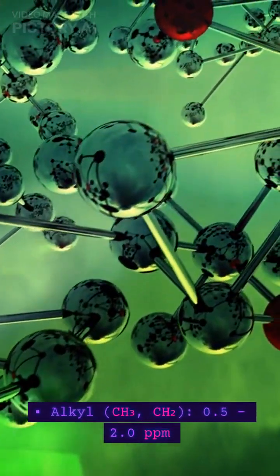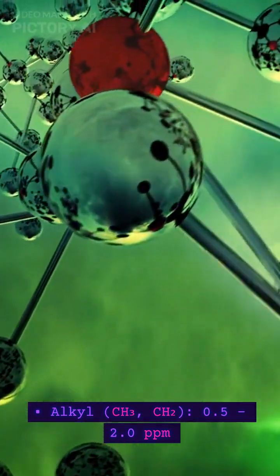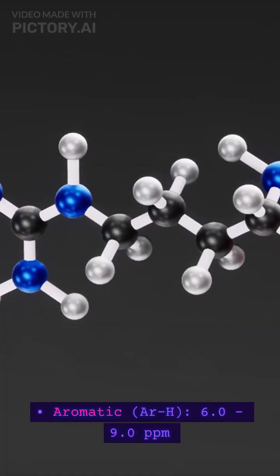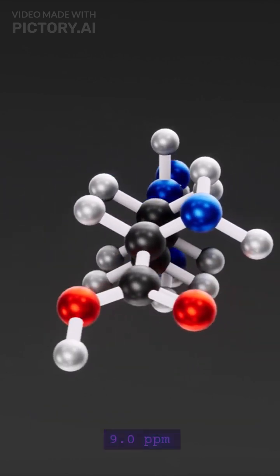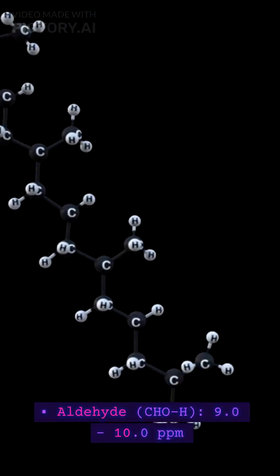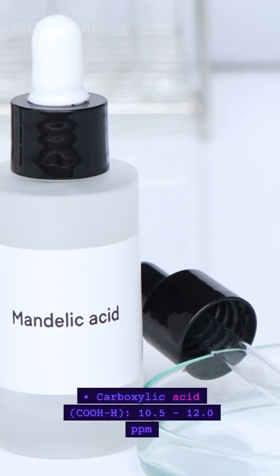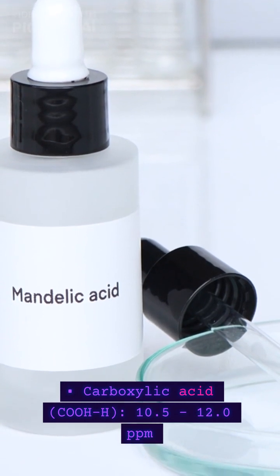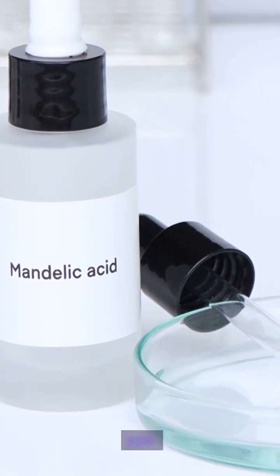Alkyl, CH3, 0.5 to 2.0 ppm. Aromatic, ArH, 6.0 to 9.0 ppm. Aldehyde, CHO, 9.0 to 10.0 ppm. Carboxylic acid, COOH, 10.5 to 12.0 ppm.